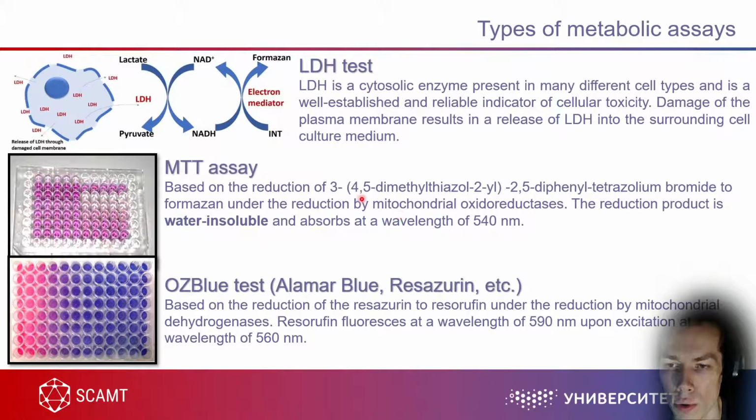Because here you need to dissolve your cells completely, and here you need also to destroy your cells on ice, so homogenize them. And this is a very useful test when you do not have many cells, or you need to add something to cells to incubate them and so on. So you can stain your cells with this resazurin maybe multiple times.